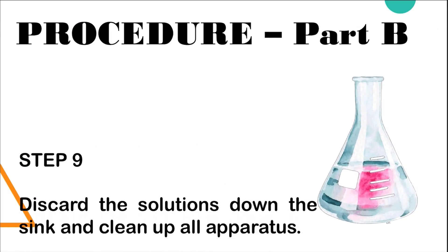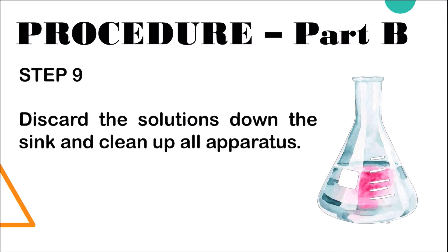Step 9: discard the solutions down the sink and clean up all the apparatus.